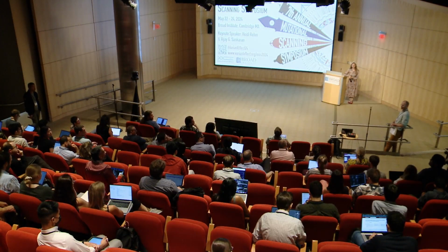Hi, great talk. I just wonder if you can compare base editing screens with prime editing screens, advantages and disadvantages. Oh, definitely. So base editor screens have the advantage that they are fairly easy to execute and allow a dense tiling of the gene of interest. However, the downside of the base editor screens is that we do not have full control over the mutations. So we are restricted by the type of editor, ABE or CBE, to the types of mutations which would be occurring in our screen. And we are also restricted by the base editing window that we use in our setting.